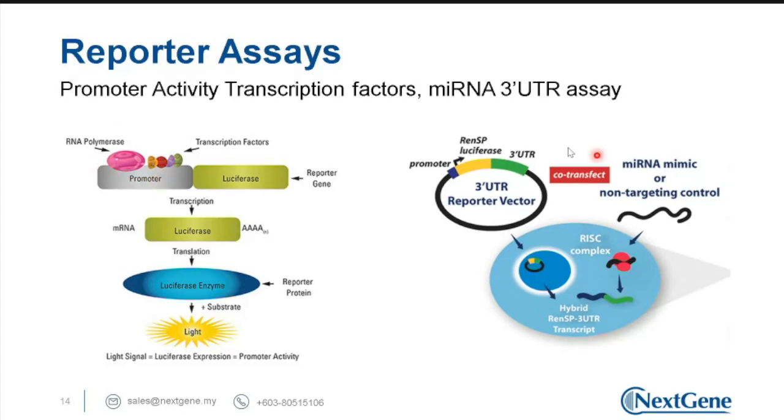In another experiment, we are using a similar setup, but in this particular study, we are looking at the interaction between microRNA and the 3' untranslated region of mRNA.